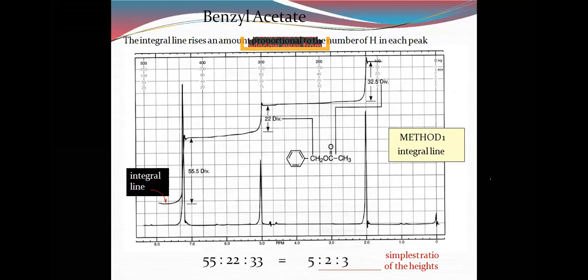3 पीक हमें दिख रही है यहाँ पे, एक 2.1 पे, एक आपको 5 पे, और दूसरा आपको 7.1 पे. So let me know, can you tell me which absorption peak is due to which type of proton? कौन सा पीक किसके कारण है? केमिकल शिफ्ट 2 पे है, 5 पे और 7 पे है. तीनों में मुझे बता सकते हैं कौन किसके कारण आ रहा है? अगर आप इसका आंसर दे सकते हैं, means you understood the NMR.